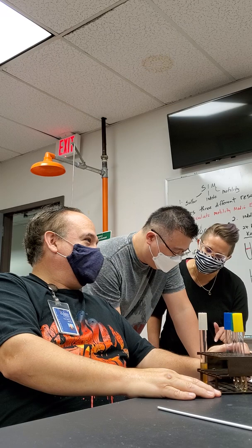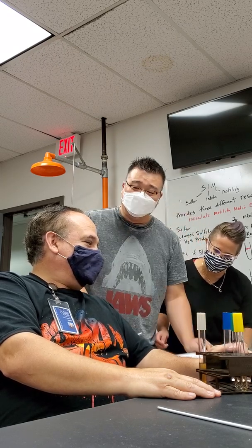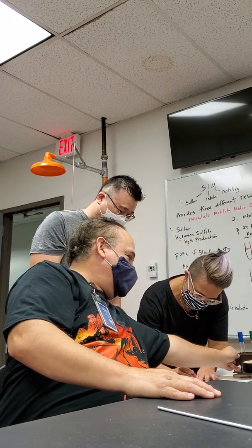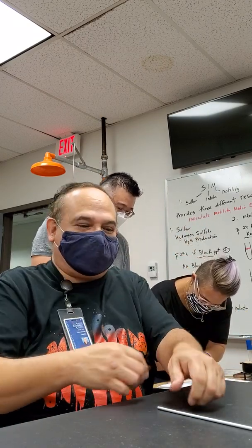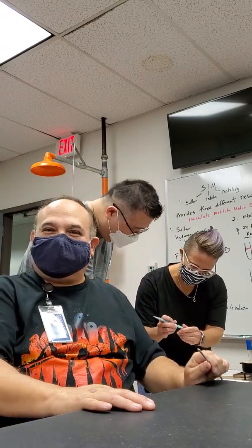Read what? B-U-T-T. Are you sure? Yes. It's first going to be on your tail, right? Yes. Not stab. Stab. Oh, sorry. No, you're good. For real. Yeah.